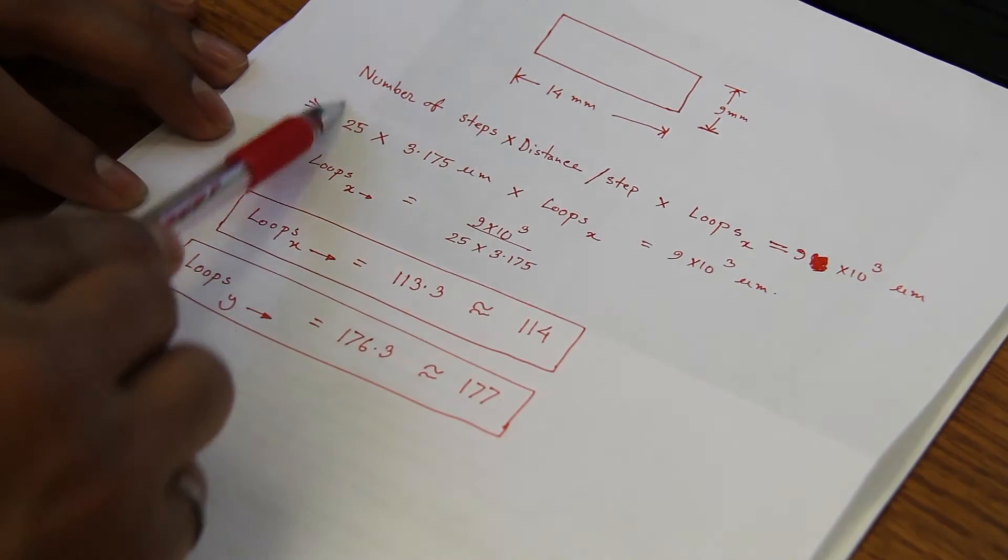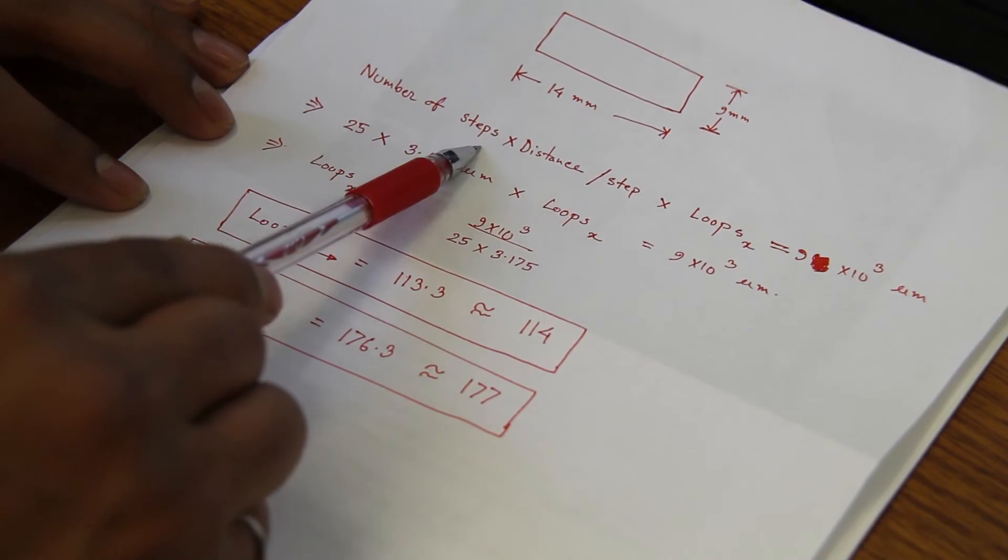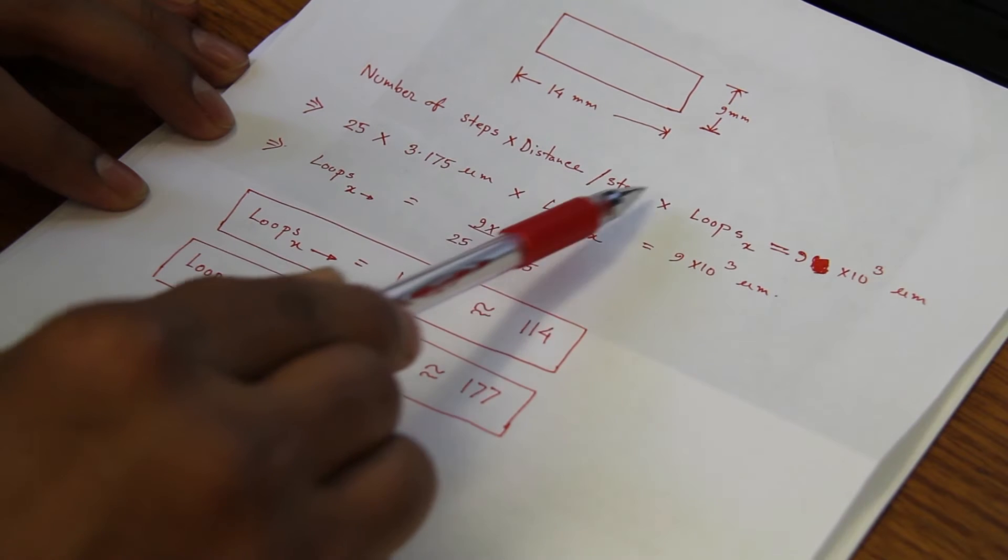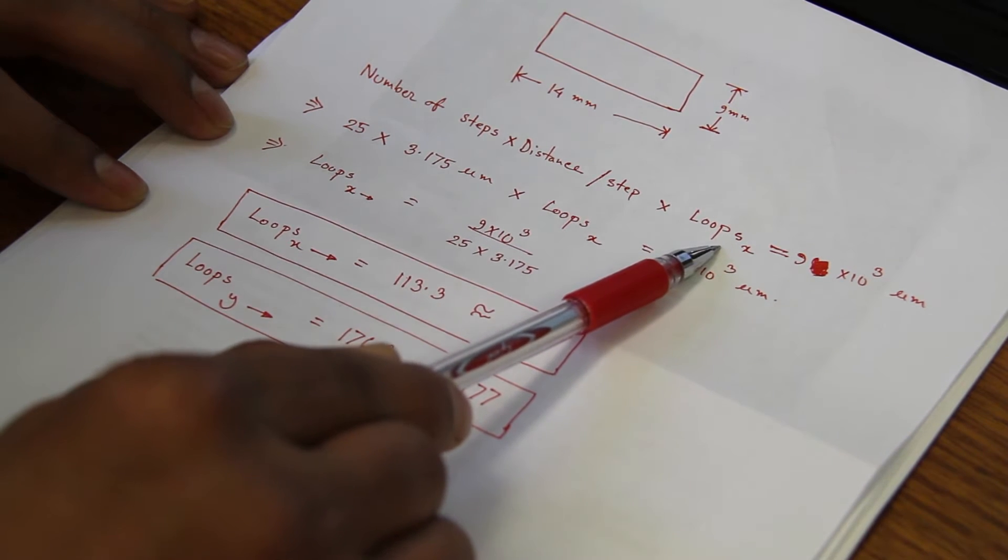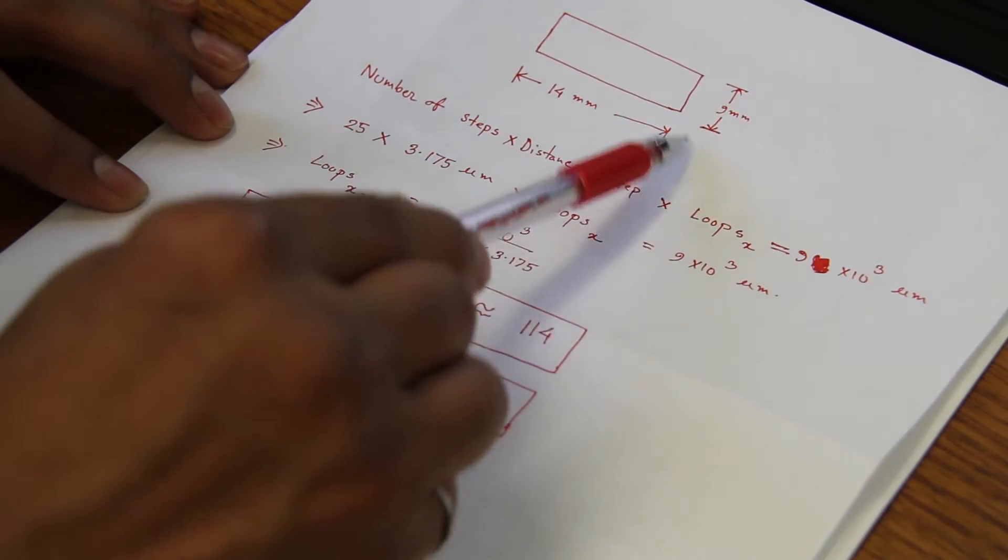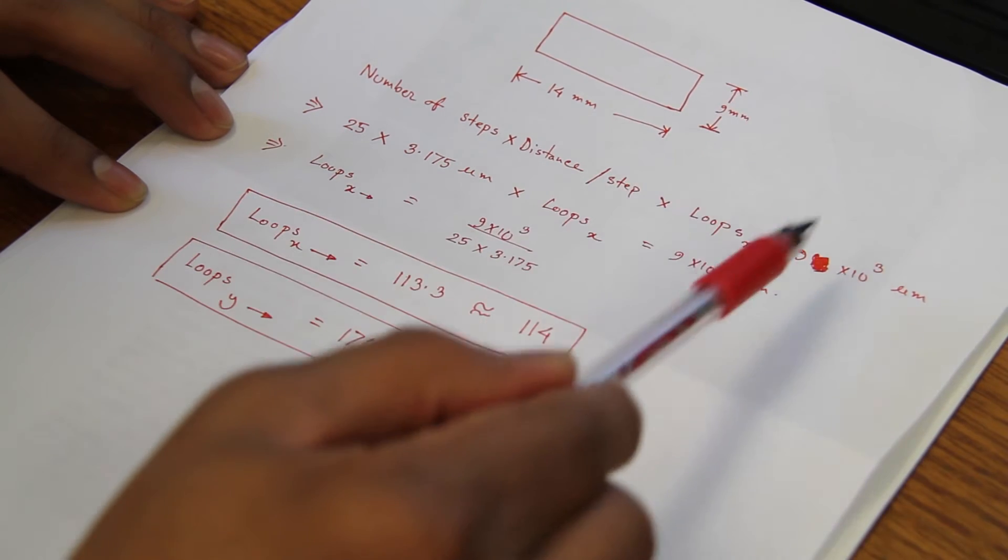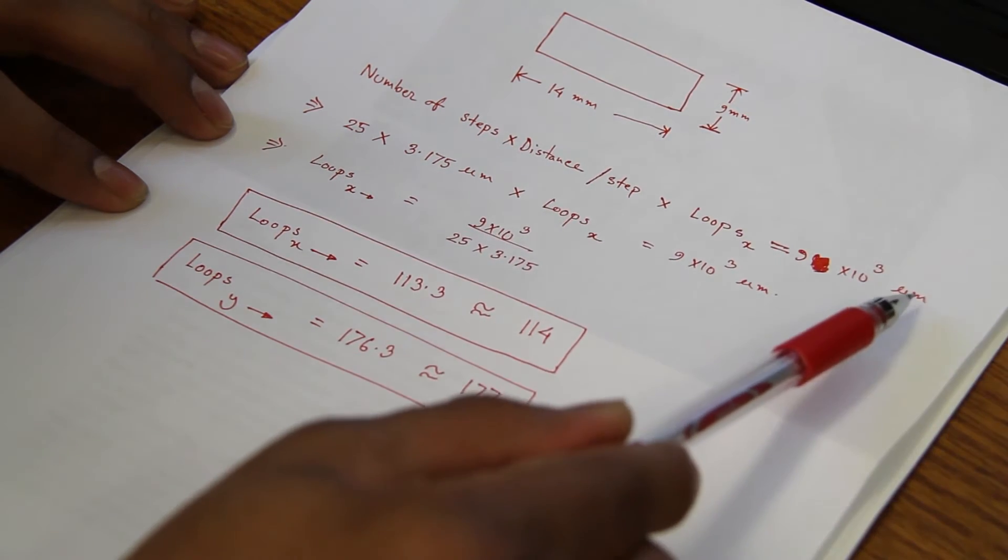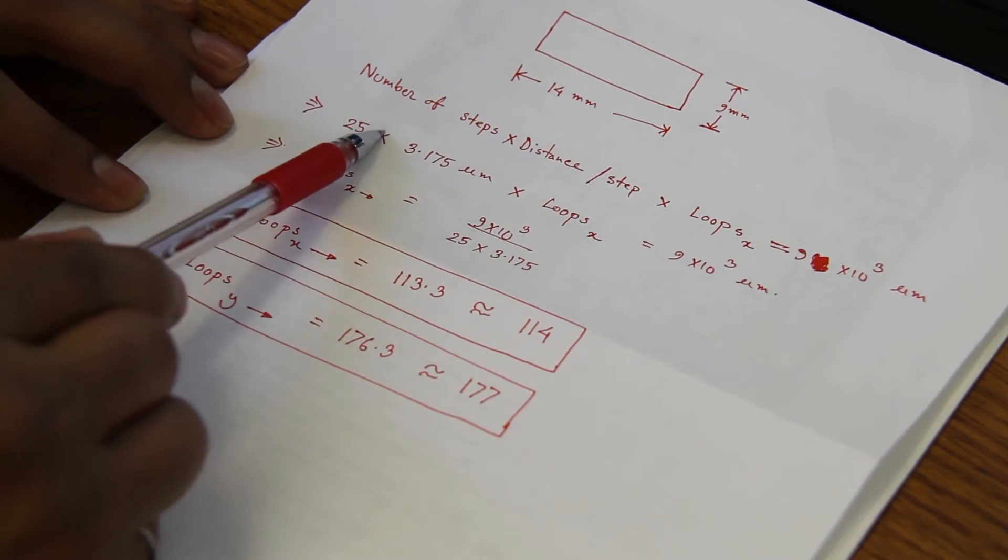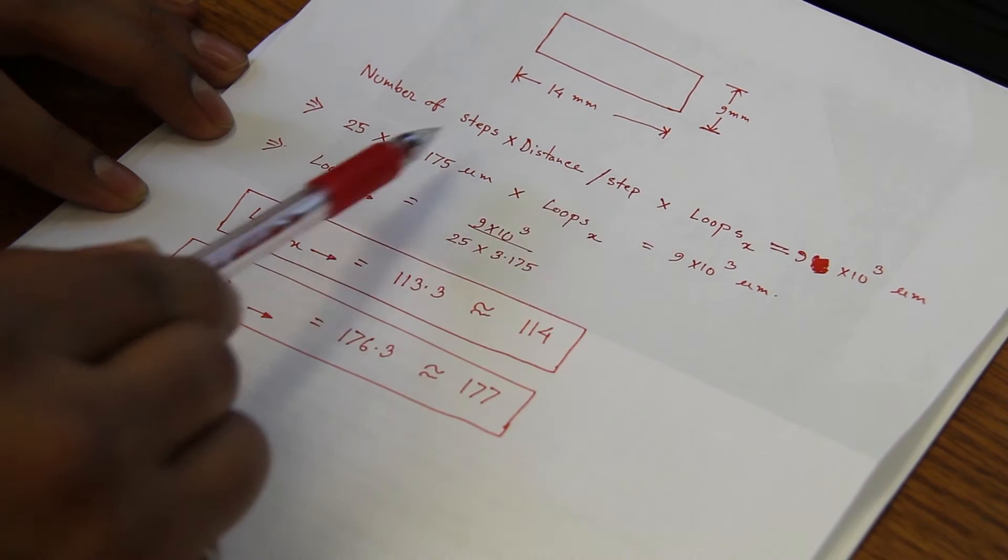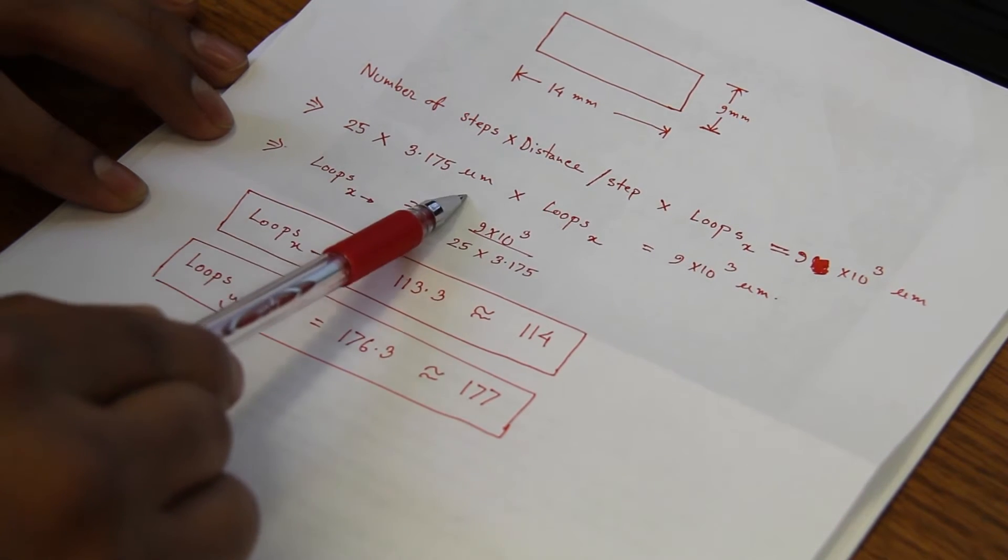Here are the calculations that we need to do for the X axis. Number of steps multiplied by the distance per step multiplied by the loops, the number of loops we need to do during the profiling, is equivalent to the distance we need to cover. In X axis we are covering 9 mm, so it will be 9 multiplied by 1000 micrometers. Number of steps for this scan we will do 25 steps. Number of distance per step will be 3.175 micrometers.